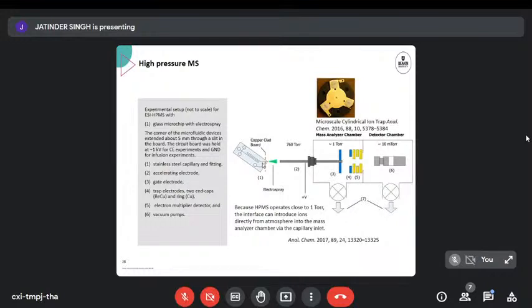We have that tip already done as a part of our cutting and our dicing of our microfluidic structures. So we don't need a little sharp thing to be sticking out that could be corroding. It is also having a lot of mass, so not as prone to dielectric breakdown than any of the other microfabricated tips we could be having. So we've got a microfluidic device, this instance with a little bit shorter channel, makeup flow, put it in front of a mass spectrometer. And what they've developed in another bit of research is a mass spectrometer that didn't need a very high vacuum, so it could work at higher pressure.